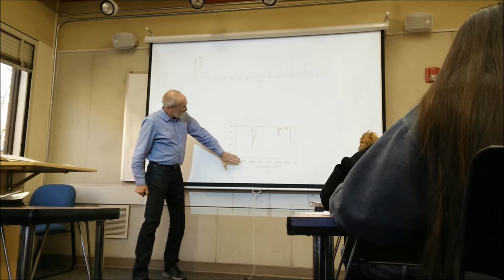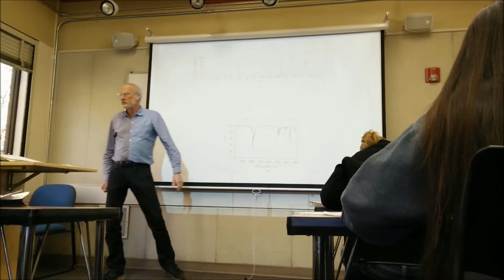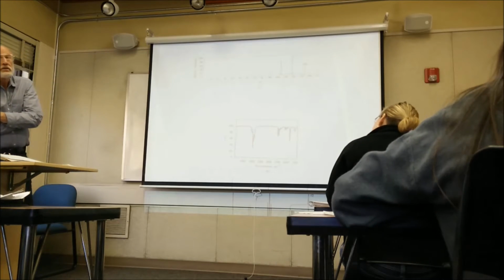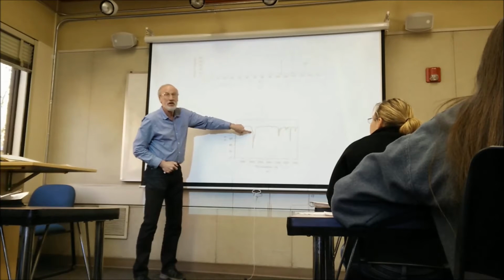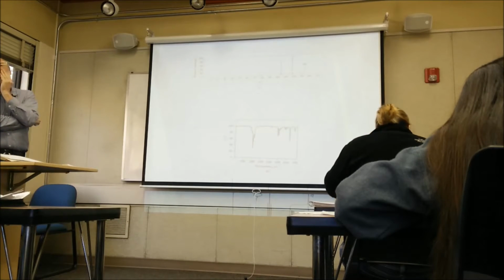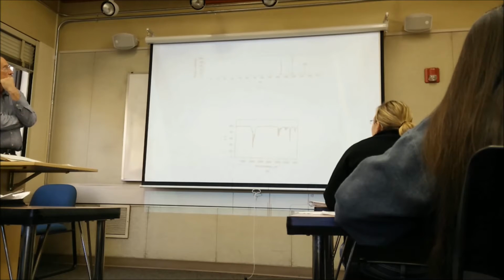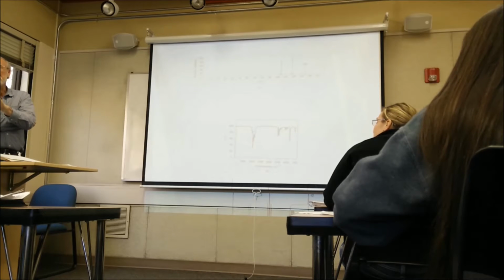What else can you tell from here? It's hard to say whether there's any above 3,000. It looks like there could be, but if there are, there are not very many of them. If that's a hydrocarbon, what's the empirical formula? It can't be C9, it has to be C8. If it's C10, 10 carbons are 120, so that would be C10H14.